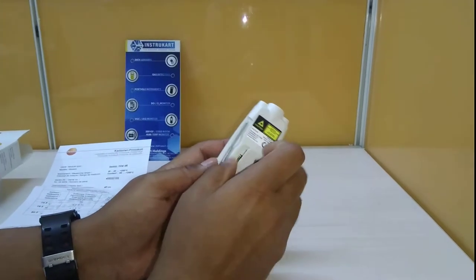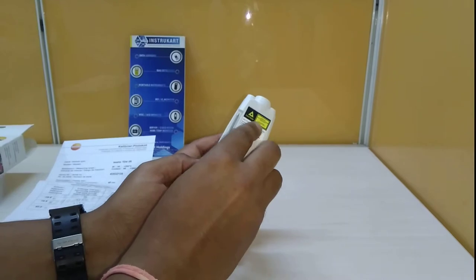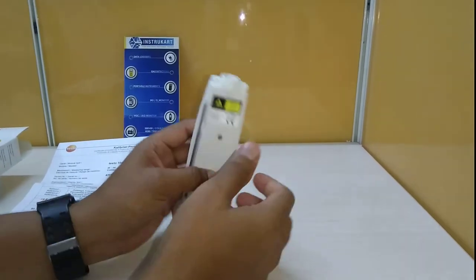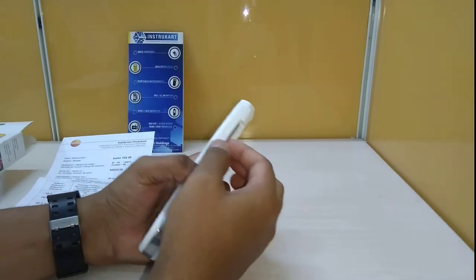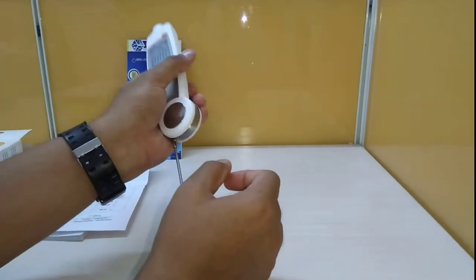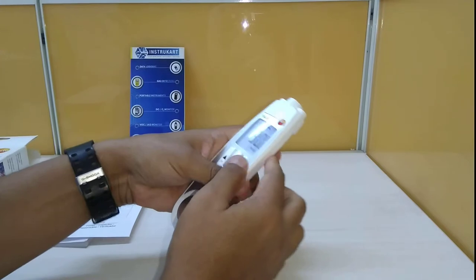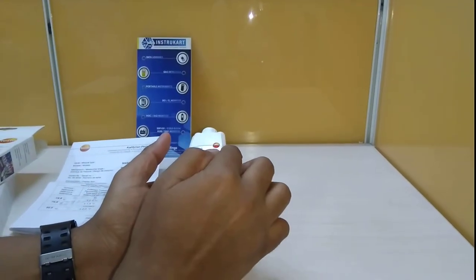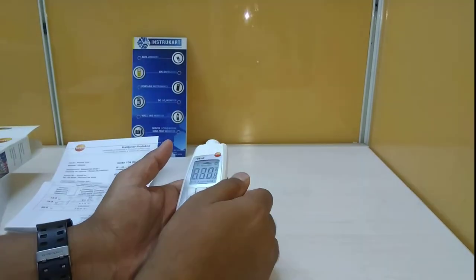This device uses two AAA size batteries. The applications are mostly in warehouses and food industries, where you can insert the probe directly into food to check its temperature, or use the infrared sensor for objects at a distance.